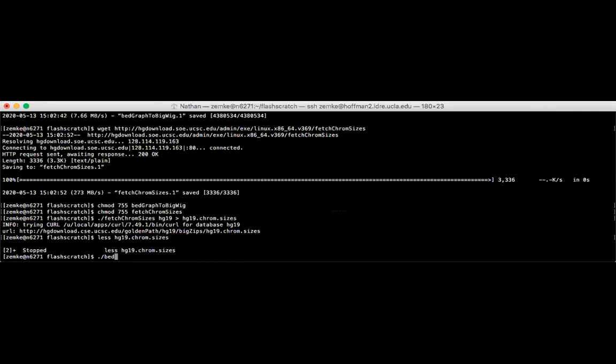Next, I'm going to use the bed graph to bigwig. So our bed graph file is stat1 6-hour IFNA treat pileup.bdg.